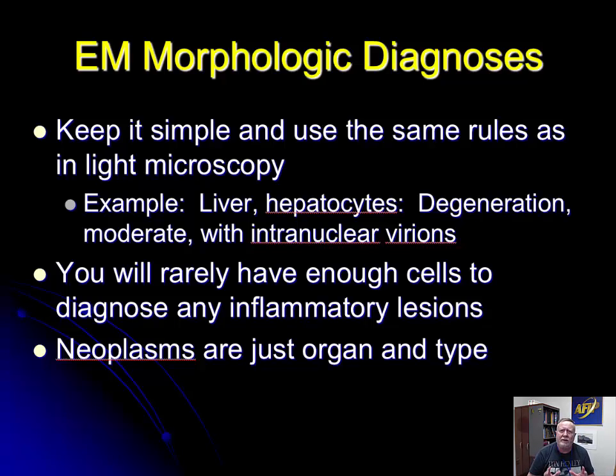The first thing to prevent overinterpretation is make sure that you're not just taking really high magnification images. Most people, when we get a good virus, they just want to zoom in on the virus and take some wonderful viral pictures for publication. But don't forget to start at a level where you can see not just the virus, but the damage it's doing to the cells.